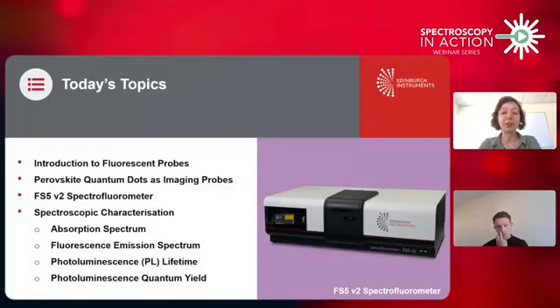This is our first webinar on photoluminescence and absorption, and it's going to be the foundation for further educational webinars. For this reason, I'm going to use this presentation to introduce the spectroscopic techniques, including absorption, emission spectra, lifetime, and quantum yield. These techniques are used in a very wide range of applications, but today we're going to focus on a particular one as an example. We will measure fluorescent probes for bioimaging using absorption and photoluminescence, or PL, spectroscopies. We're going to perform all these experiments in the same instrument, the FS5V2 spectrofluorimeter, which is shown here on the right.